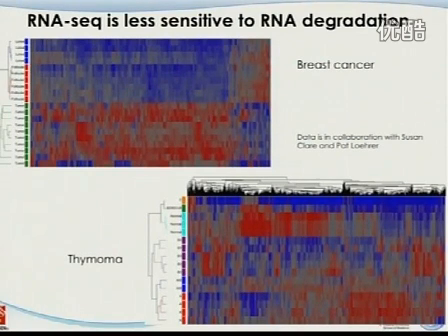And for the thymus cancer, this becomes even more striking. Most of the pathology information, the different subtypes of those cancers, was determined by Sunil, by the way, who is one of our best pathologists. But we really don't know whether it's correct. After we did the RNA sequencing experiment and clustered the data together, we saw that Sunil did a pretty good job. You can see different colors cluster together for different pathology, different subtypes of thymus cancers, and they go together.